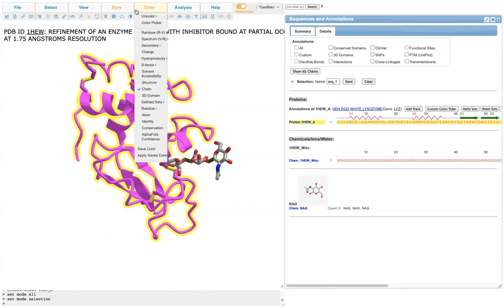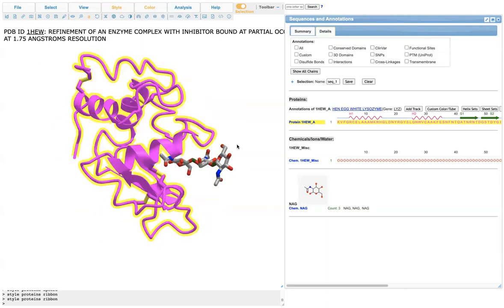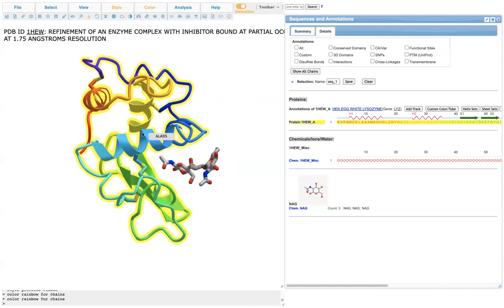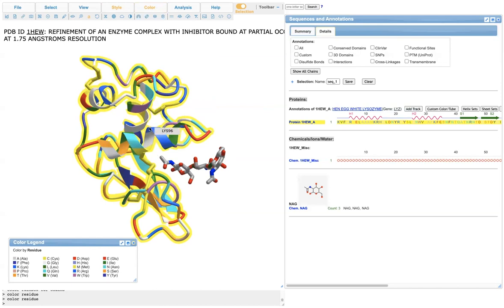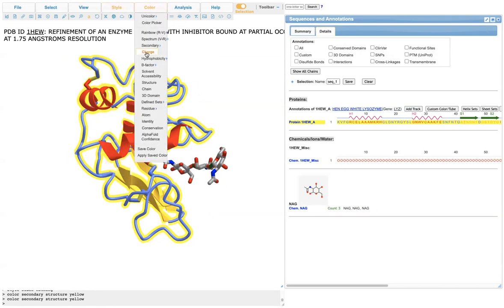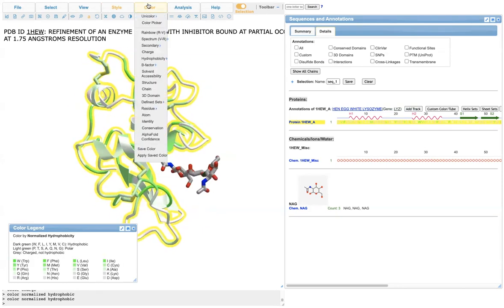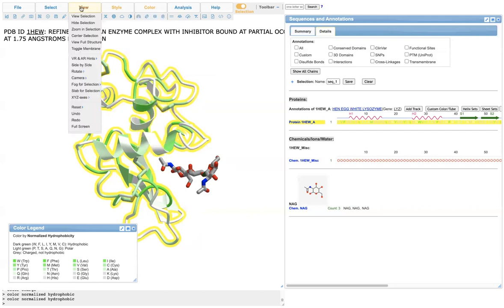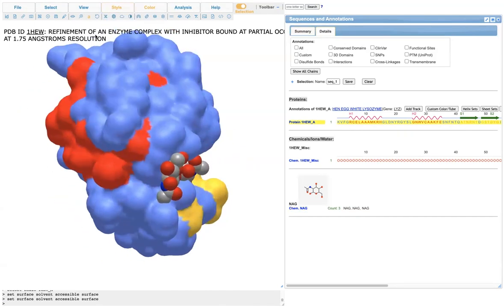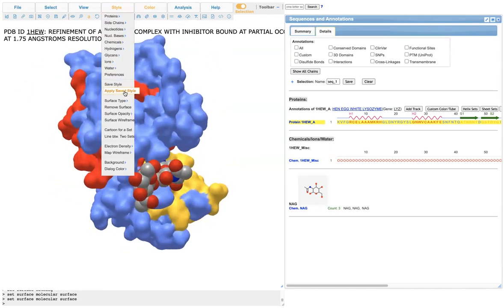What's really, really cool about it is that although it can't do quite as much as ChimeraX and PyMol in terms of things like making publication quality figures and doing really complex functions, it can do things that those can't. One is that it's integrated with databases, so you just put in the PDB accession code and it'll automatically bring in all sorts of information, things like post-translational modifications, conserved domains, really, really cool stuff.